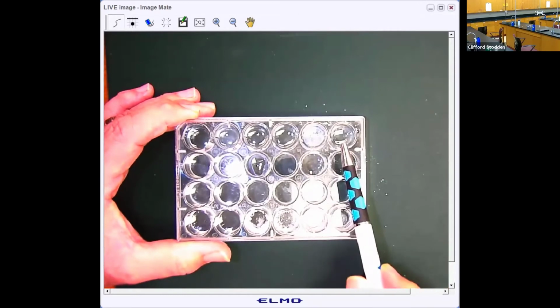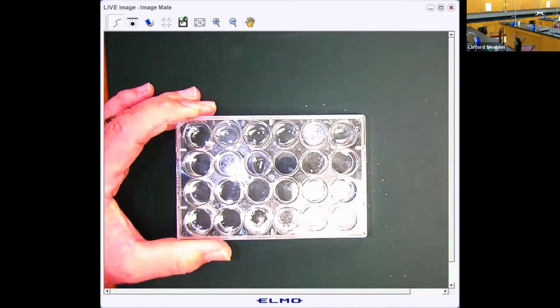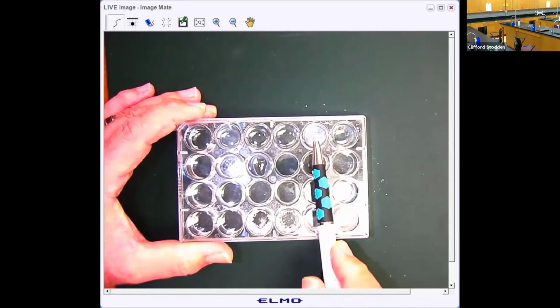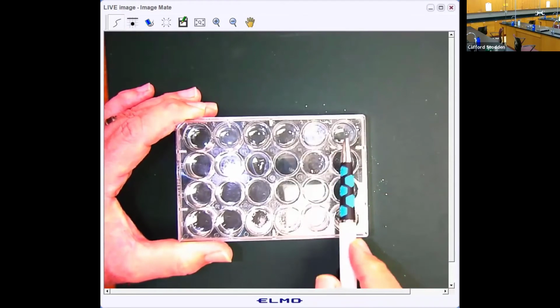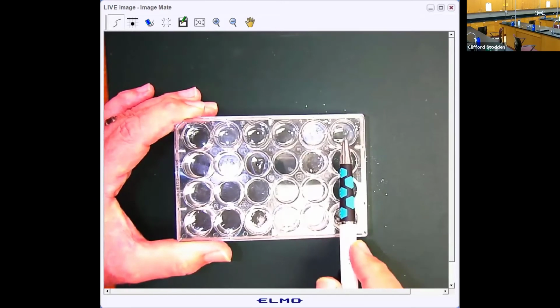This one cleared up. This is exactly the same compound that's in your lab manual with the aluminum and the sodium hydroxide. For the ammonia, you'd put P, white precipitate. Here, you'd put P, D, because initially you had a precipitate with just 3 drops, and then it dissolved after bringing that up to 10 drops.